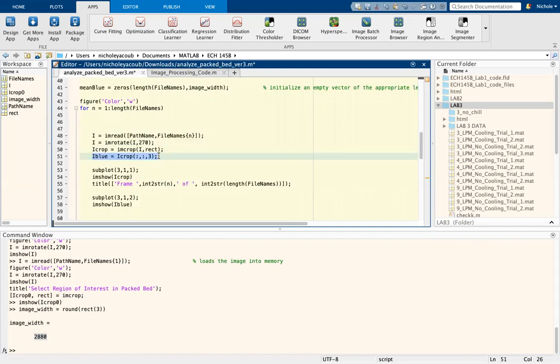And so as saturation increases and we turn towards a clearer color, we're actually increasing the blue pigmentation. And so that's ideal for us because as saturation increases, the blue will increase, and it's a logical way to interpret the data. So this just selects the third index in the Z direction, which is just the blue pigment.